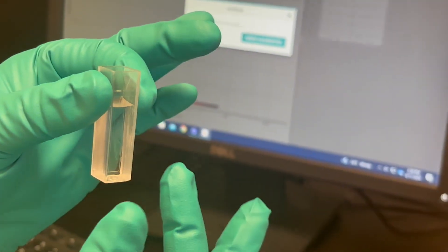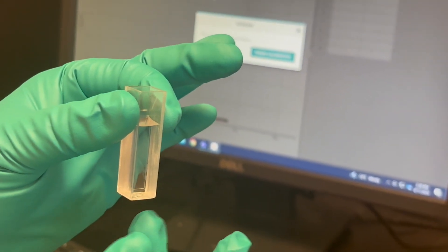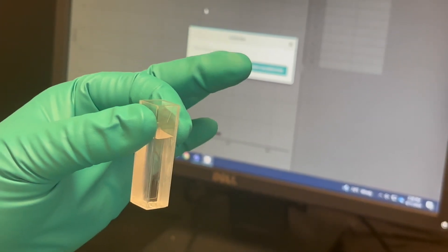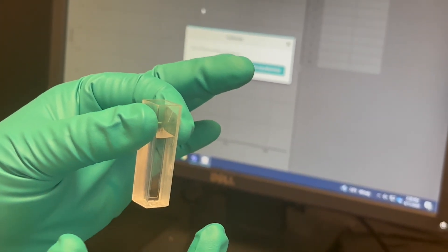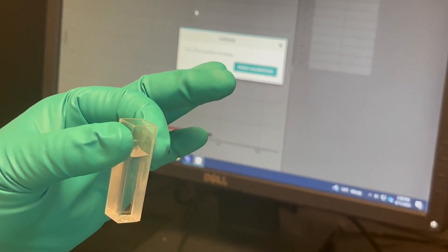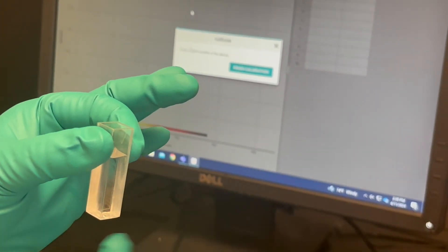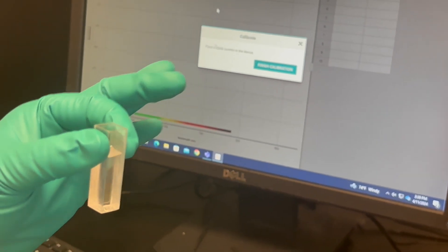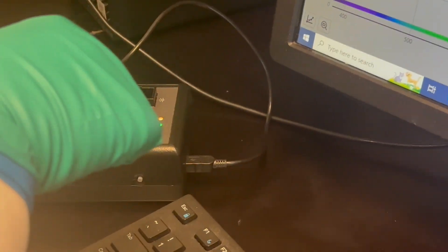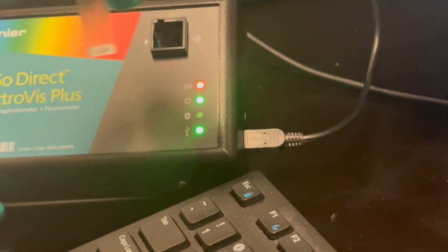Some of our cuvettes will have a thinner area on the side. Not this one. But make sure that you're angling your cuvette properly. So you match that arrow up with this arrow over here.